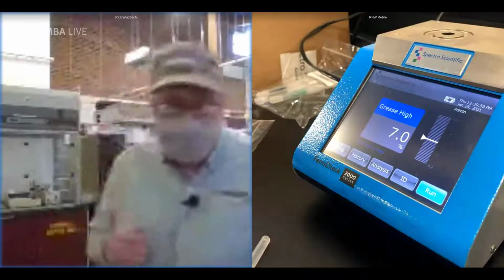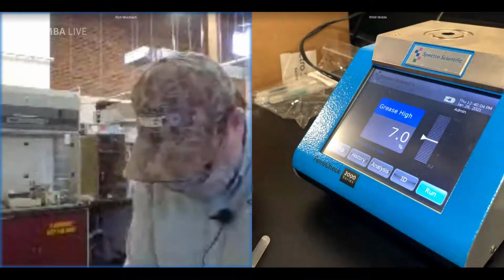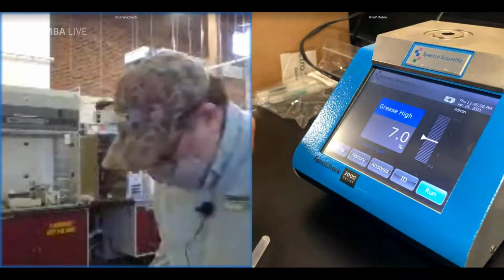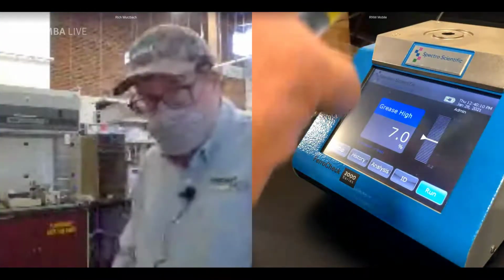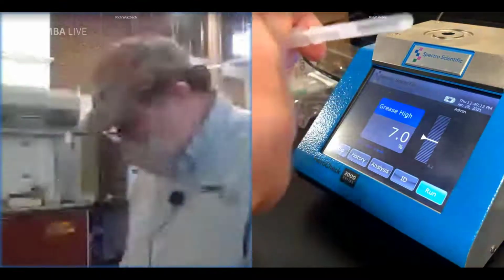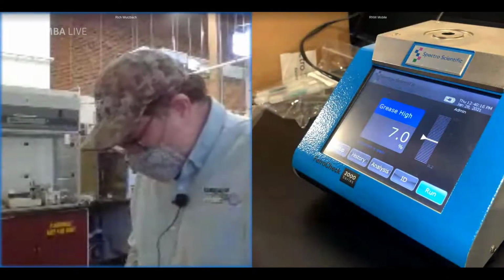And let's see, I got a spatula. Now I'll cheat a little bit and I'll use a second one of these units. But this is the process to go ahead and take a measurement. I have to take the cap off.